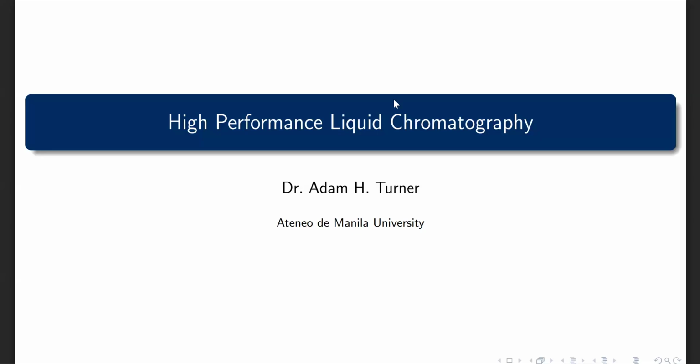Welcome to this slide and this lecture on high-performance liquid chromatography, otherwise known as HPLC. In the previous lecture, we built the theoretical foundation. We looked at partition coefficients, retention factors, plate theory, and the Van Deemter equation. Today, we apply all of that theory to the single most important chromatographic technique in modern analytical chemistry. Every concept from the fundamentals lecture maps directly onto a specific component or decision point in HPLC, and we'll make those connections explicit throughout. Let us begin.